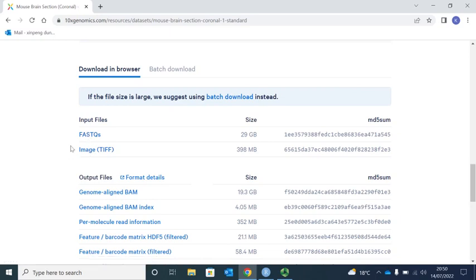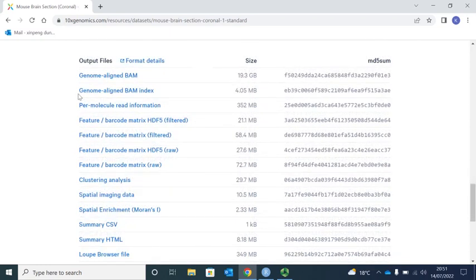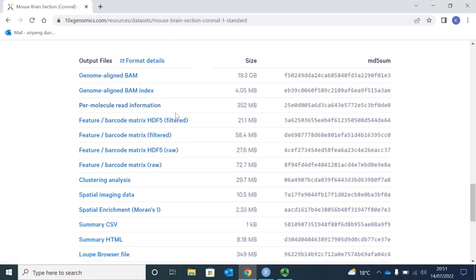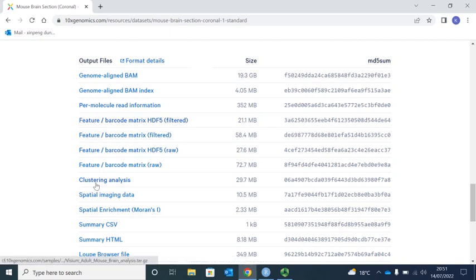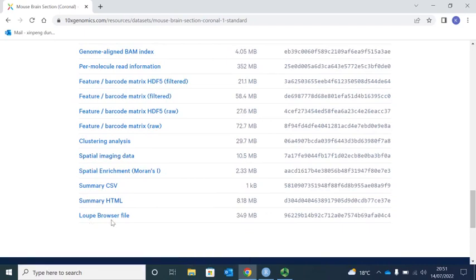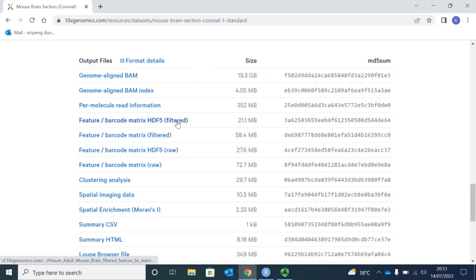Those files were input into the SpaceRanger pipeline and analyzed to generate the output files. There are lots of output files: the BAM files, read information, features, barcode, and metrics, clustering analysis, and spatial imaging data. They analyze the data by the local browser. But to do the analysis in R, we just need the filtered features, barcode, and metrics in the HDF5 file.